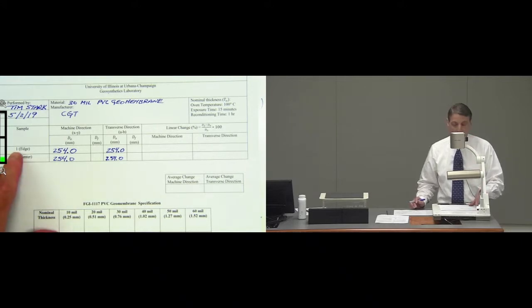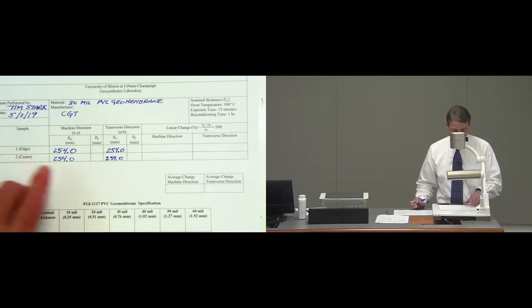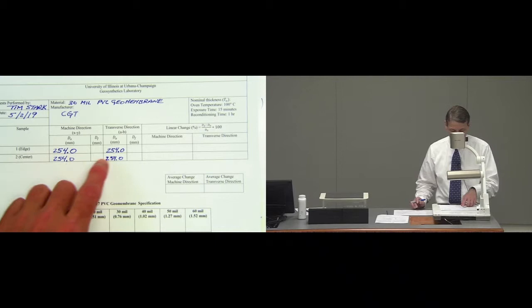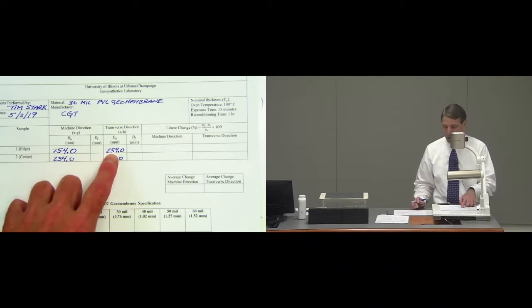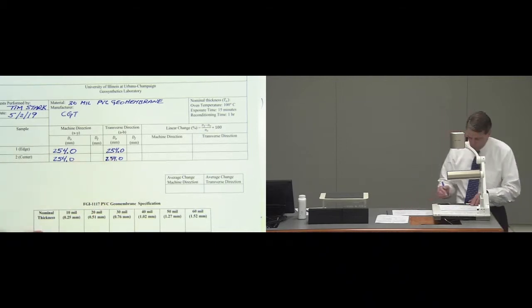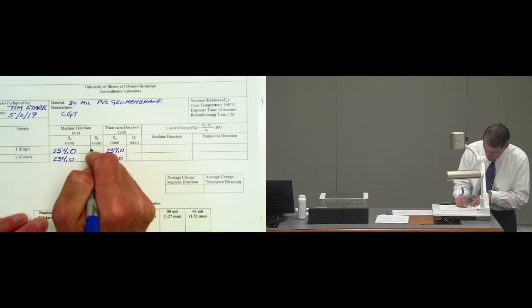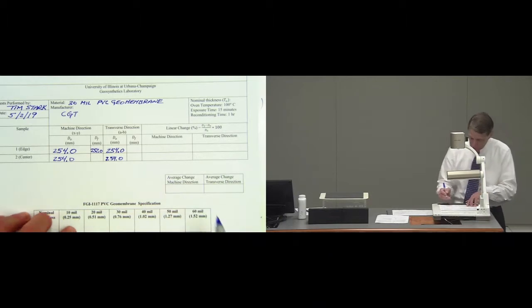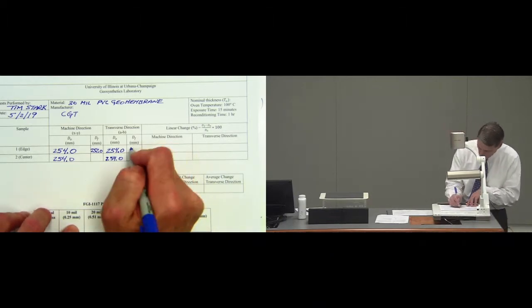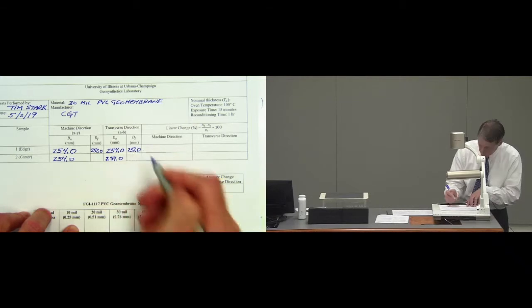254, there's my data sheet, edge and center. 254 initial and 254 initial in the transverse. I measured 252 in the machine and 251 in the transverse direction.